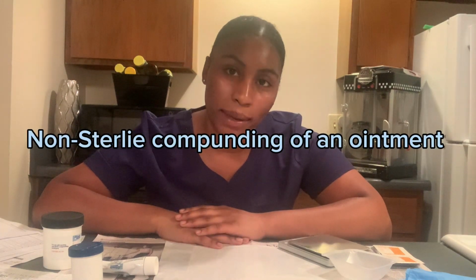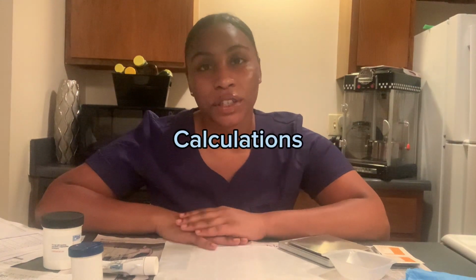Hi, my name is Kiosha Smith, and today we're going to be doing skill set 6, non-sterile compounding of an ointment. So before we begin, we have to do our calculations for the prescription that is given to us.